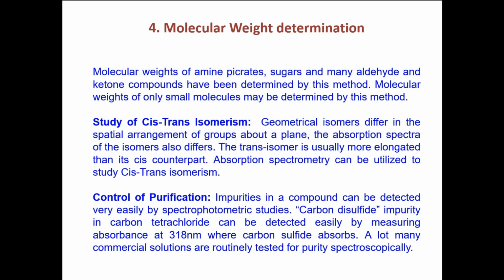This molecular weight determination is very specific. It is specific only to small molecules, not for large molecules. So small molecules can be subjected to molecular weight determination in UV visible spectrophotometry.